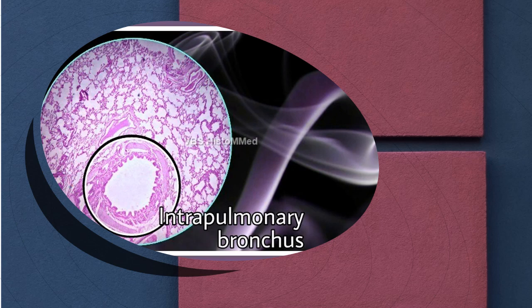We will now look at the first component of this discussion — the intrapulmonary bronchus. Then we will go into the smaller, histologically identifiable cross sections of the different parts of the bronchial tree down the line. We saw the intrapulmonary bronchi in the previous gross specimens. Here is a cross section of one of these.